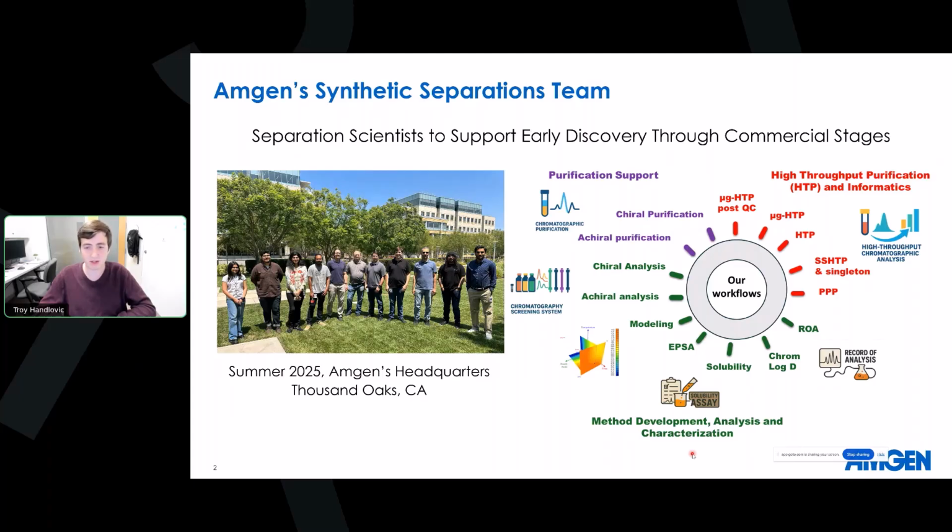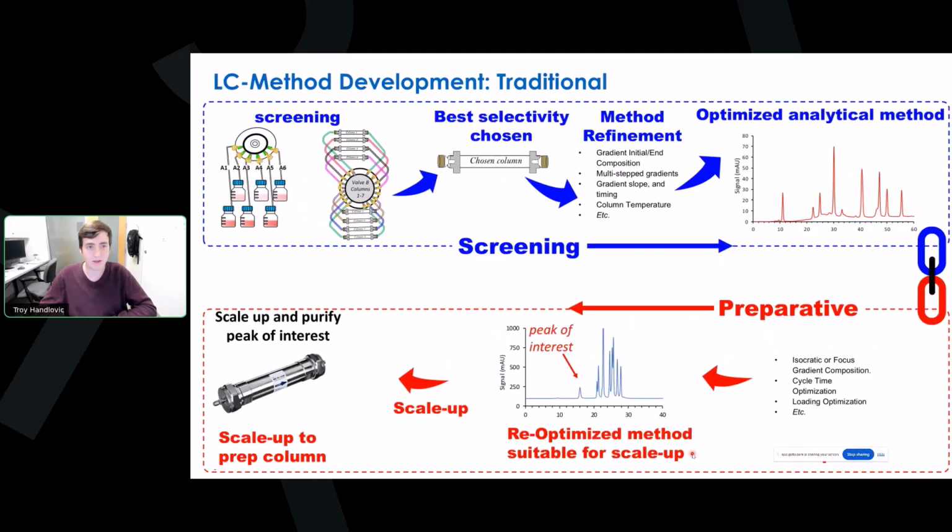So today we'll spend time talking about method development and in silico modeling, and for the specific application of greener, more efficient method development. We are a high throughput lab, and since we're a high throughput lab, we take a more brute force approach, not as targeted as the nice talk that we heard earlier.